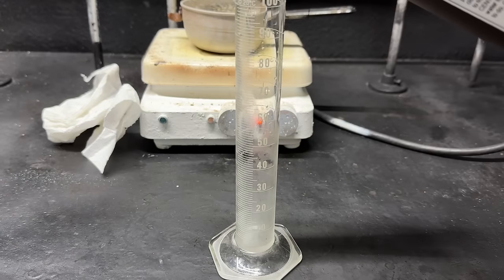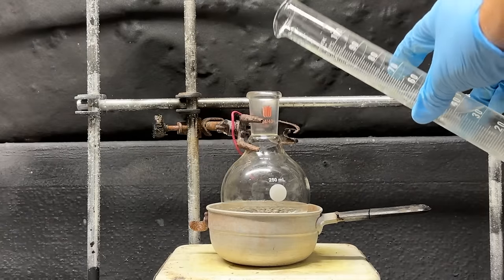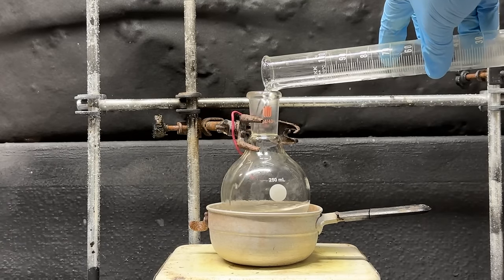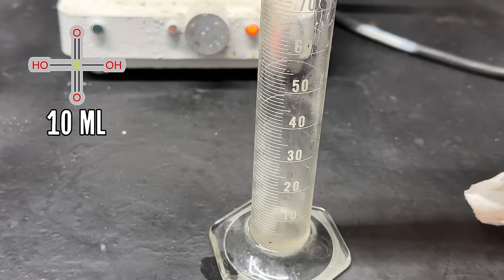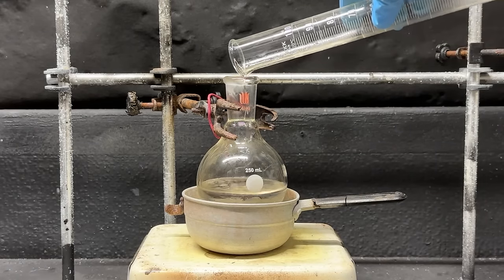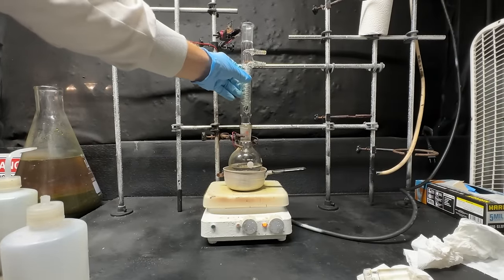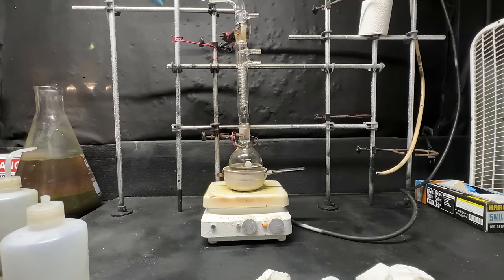Now I'm going to pour out 40 milliliters of isoamyl alcohol and add it to our 250 milliliter round bottom flask. Then I'm going to pour out 10 milliliters of concentrated sulfuric acid — this will be our catalyst for the esterification reaction — and add it to our round bottom flask as well. Now I'm going to add a condenser on top and a gas adapter on top of that. That's all we need.